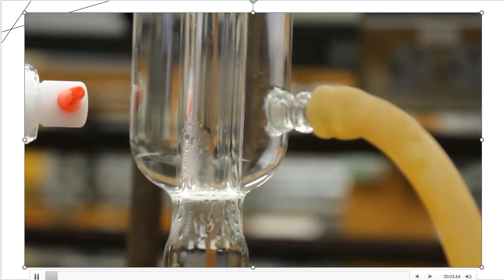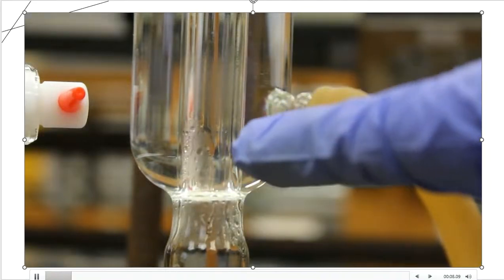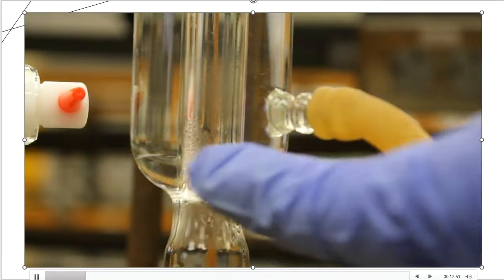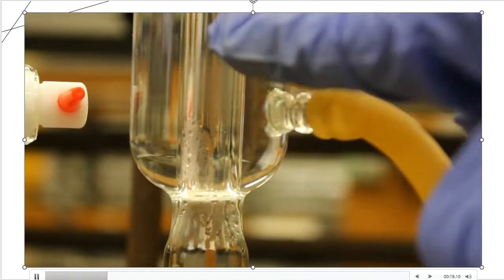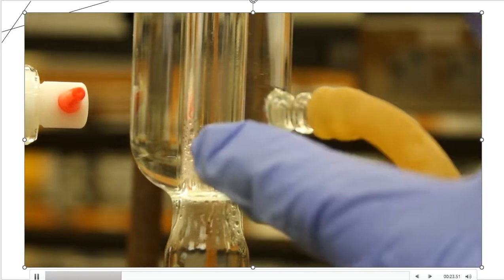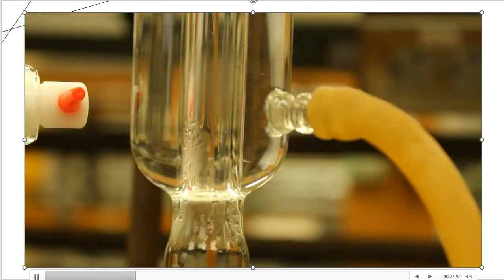All right, so this is part of the reflux condenser, and I want to show you this because you can actually physically see the condensation here. You can see the droplets that are forming inside of the condenser apparatus on top, but nothing really is happening up here toward the top of the screen. It's all here, and we call that the condensation ring. As long as that liquid droplet doesn't approach the very, very top of this condenser, I know that I'm not losing any vapor from the reaction.